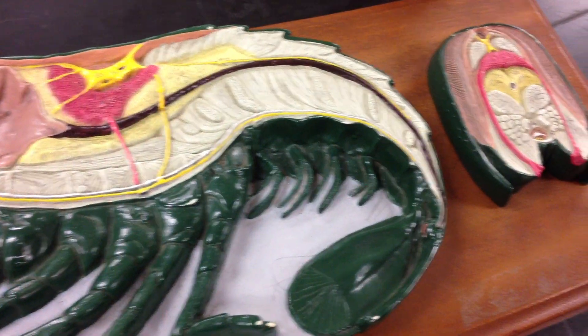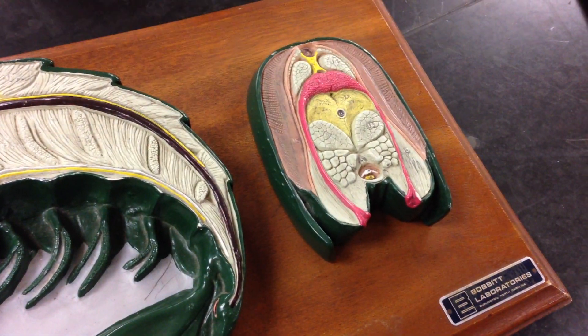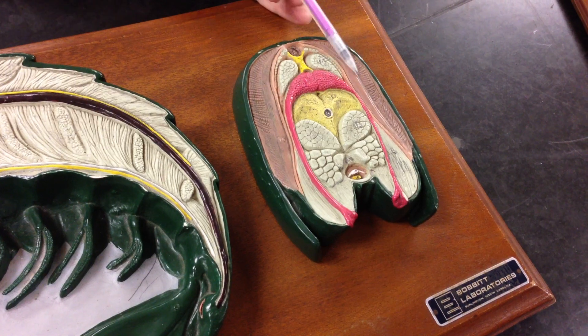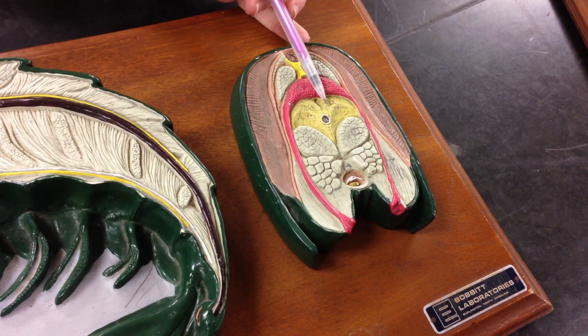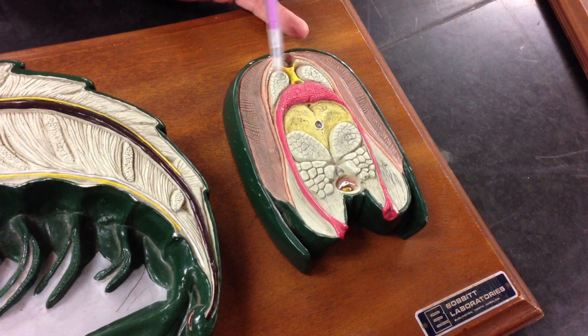That's the anus — can't forget the anus. Here on the outside we can find a piece of the exoskeleton referred to as the carapace. Here are the gills. There's the heart, gonads, digestive gland, intestine, abdominal flexor muscles, and abdominal extensor muscles.